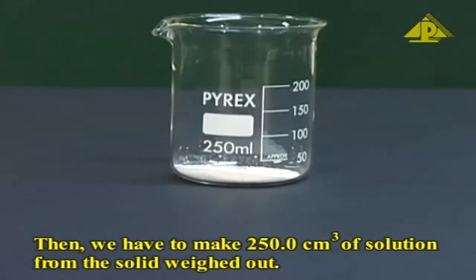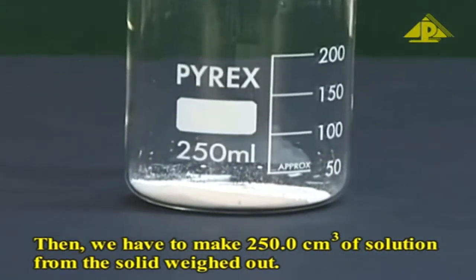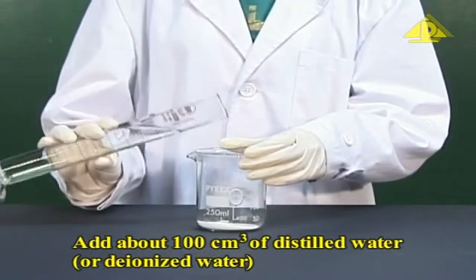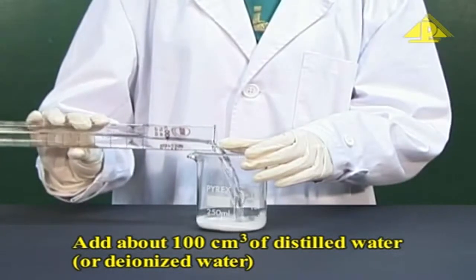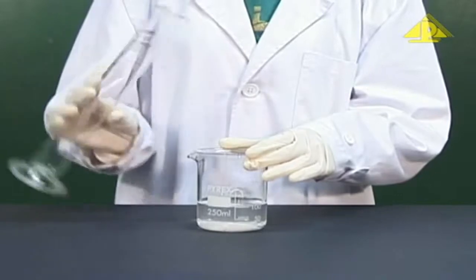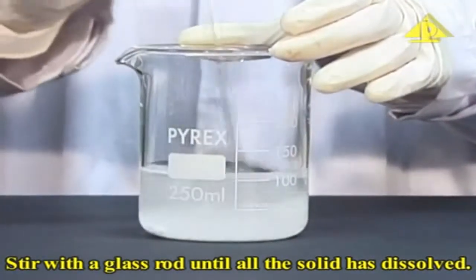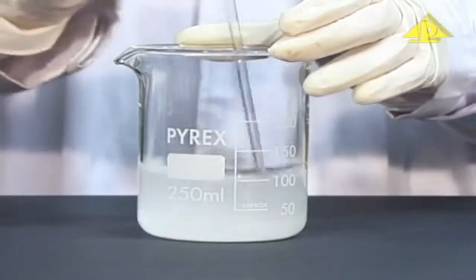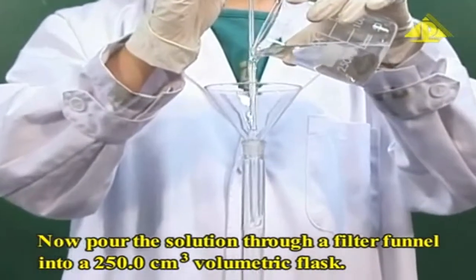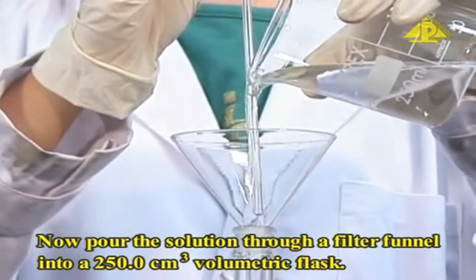Then we have to make 250 centimeters cubed of solution from the solid weighed out. Add about 100 centimeters cubed of distilled water or deionized water to the beaker containing the sodium carbonate. Stir with a glass rod until all the solid has dissolved. Now pour the solution through a filter funnel into a 250 centimeters cubed volumetric flask.